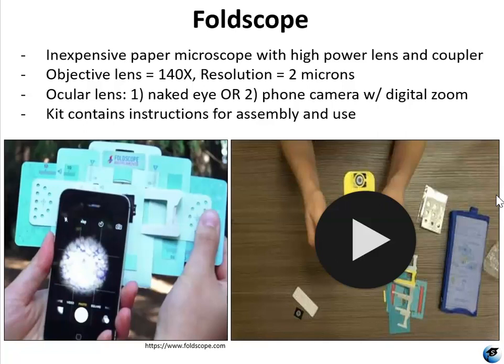You're going to want to follow the instructions within your kit for assembling the Foldscope, creating slides, inserting slides into the scope, and how to view the slides. The procedure for Lab 3 contains links to videos that will help demonstrate those instructions a little further. And I've actually included here a little compilation of short clips from these videos. They're much longer and much more detailed, but here are just a few clips.